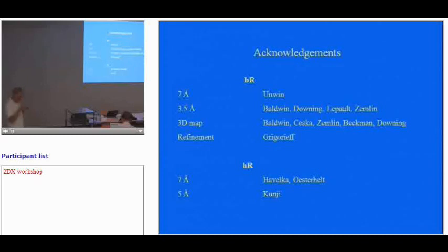Baumeister published a paper subsequently, about 5 or 6 years later, showing that it was really P3 and not P6. By picking out the unit cells and treating them separately and flipping them correctly, you got the real structure as opposed to a structure with some extra added symmetry that isn't really there. The 2 examples I showed are because we were aware of this.